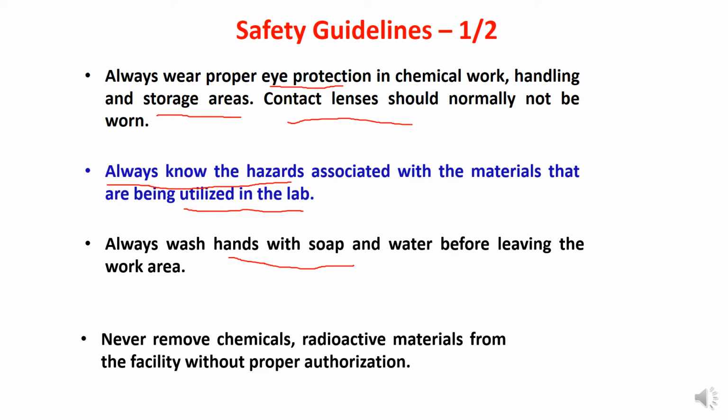And next, this practice is very important, and more practically, never forget it. If you are working with certain chemicals, whether different salts, acids, radioactive material, or any other solution, bottle, or stock, please don't remove the chemical from its position.